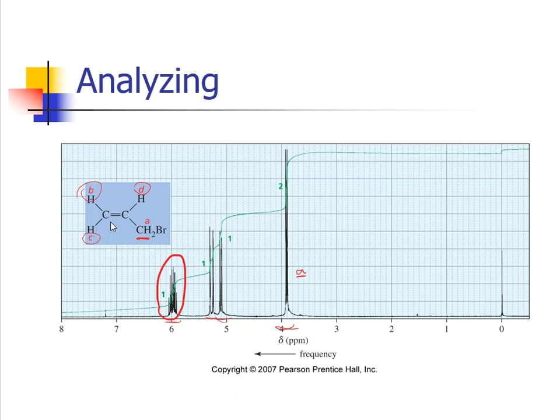And then in addition to that, Lord have mercy, look at this at number 6. This is going to be probably for D, and I take a look at the neighboring carbons. Those neighboring carbons here are not equivalent. They're actually different. So it's almost like I would do a 1 plus a 1, and then here would almost be another 1 plus a 1, because they are not chemically equivalent or the same, so I have to treat them separately. And then over here is a 2 plus 1, and that will be 2 more protons. Those are equivalent to each other, so that's a 2 plus 1. So that's a 3, and that's a 2, and that's a 2.